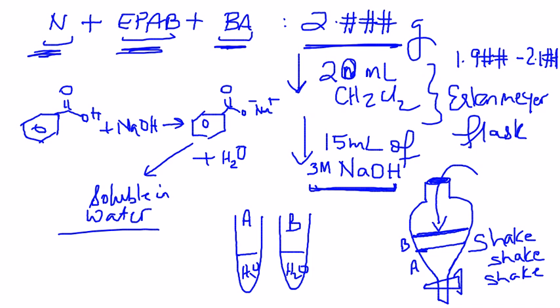Whichever of the two, A or B, is the water layer should be water and water, so you should see mixing. On the other hand, the one which is organic should either form a layer on top, or you will see it fall as globules at the bottom, depending on the density again. So that is something which you will be able to run.